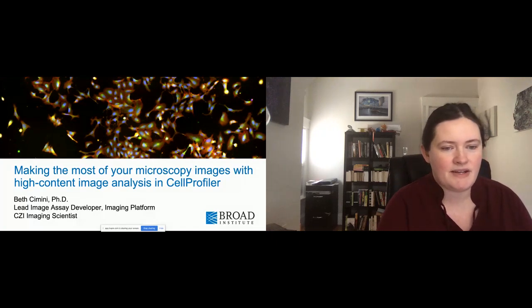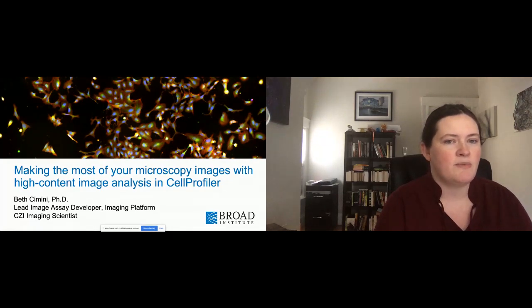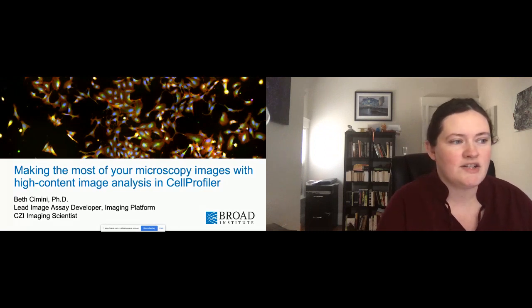My name is Beth Cimini. I work at the imaging platform, which is also known as Anne Carpenter's lab at the Broad Institute. I'm a CZI imaging scientist, and I've been a member of the CellProfiler team for about 5 years now. I want to talk to you guys a little bit about why you might use CellProfiler, why we think CellProfiler has a place in the wonderful, huge, chaotic, fantastic open source image processing ecosystem, and then give you a little bit of a demonstration and answer any questions you have.